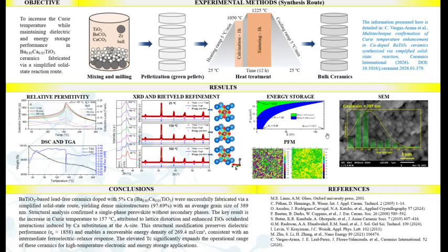Finally, a quick look at PFM. Before poling, the ferroelectric domains point in different, essentially random directions. After we apply an electric field, they align, which tells us the domains are genuinely mobile and switchable, consistent with everything we saw in the hysteresis loops.